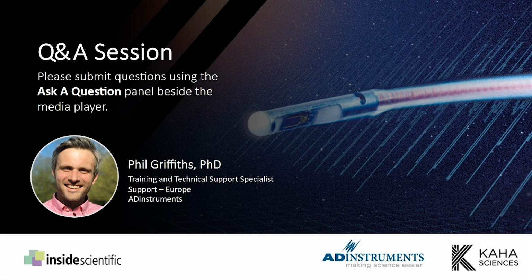Great. All right, another really awesome question here. So this person has said, I work in respiratory neuroscience, and I was curious if there were any applications regarding plethysmography methods. Currently, we use a pit tag telemeter for temperature monitoring. Are there any applications for this telemetry regarding respiratory research?